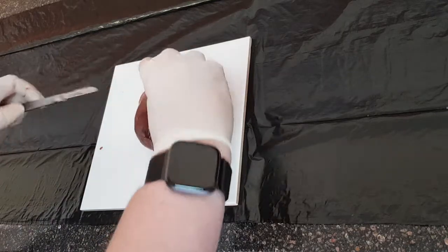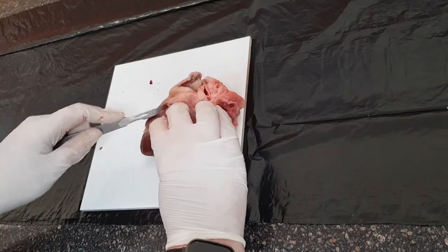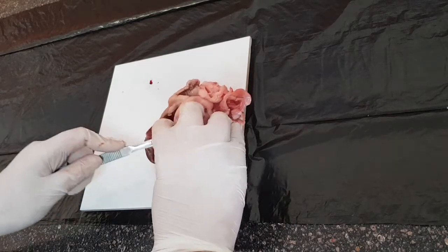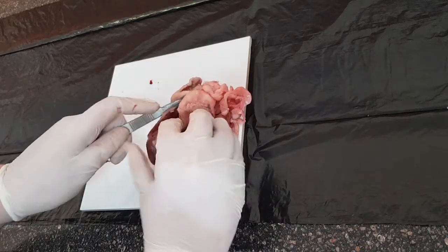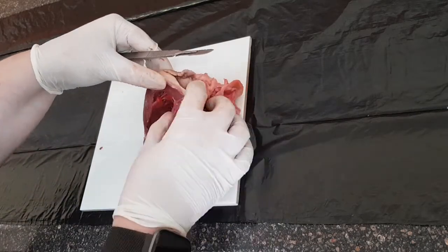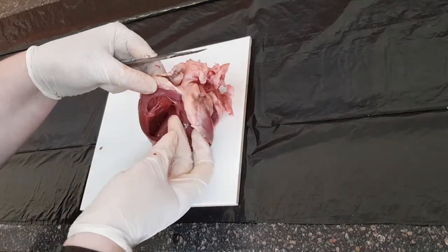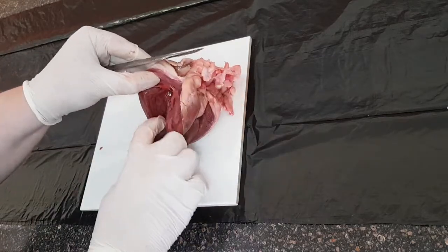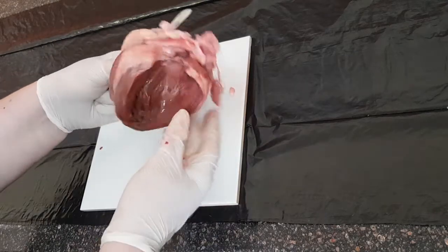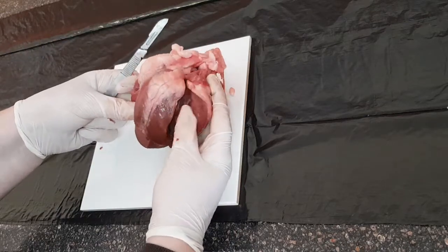So if we cut from this side, let's see if we can see our other chamber. Okay, so if I opened up on this side, I can see my other chamber with my valves in there, connecting through to my ventricle. And this wall is a lot thinner than that wall, which means this is the right side, and that's going to be the left side of it.